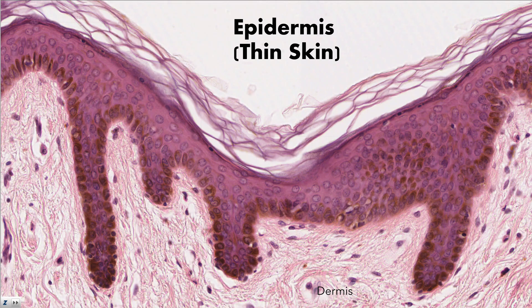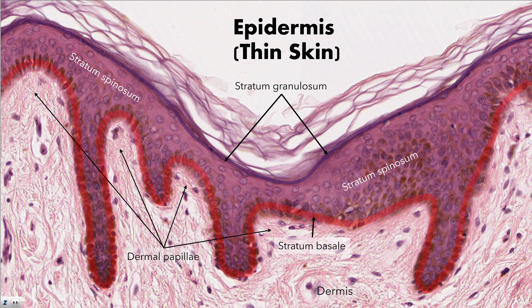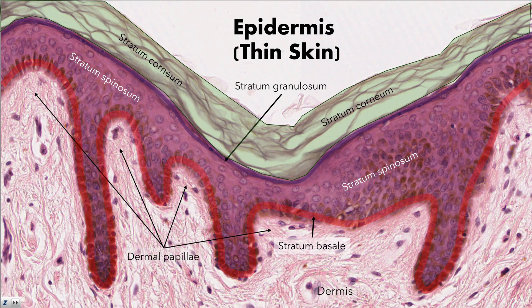We see the same basic organization in thin skin as we do in thick skin. The primary difference is the lack of a stratum lucidum in thin skin. Dermal papillae form an irregular up and down surface to which the stratum basale is attached. The stratum spinosum fills in the space between the stratum basale and the stratum granulosum. The stratum granulosum seems to form the outermost contiguous layer in most thin skin sections. Note the lack of an easy-to-see stratum lucidum. Finally, the much thinner stratum corneum is only composed of an average of around 20 layers. Without the intermediate step of eleidin formation, the layers of cells in the stratum corneum are not held together very well, and they form something that looks like scales or piles of hair sitting on the stratum granulosum. Thin skin stratum corneum does appear very different than thick skin stratum corneum, but they are actually the same layer.